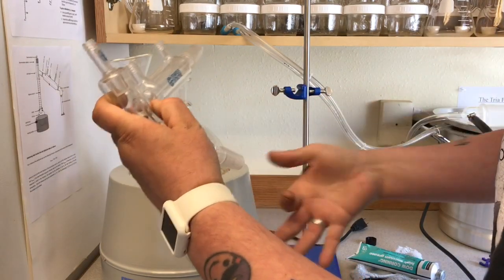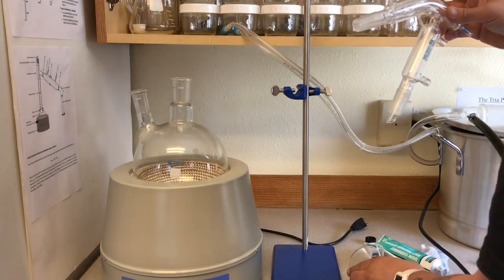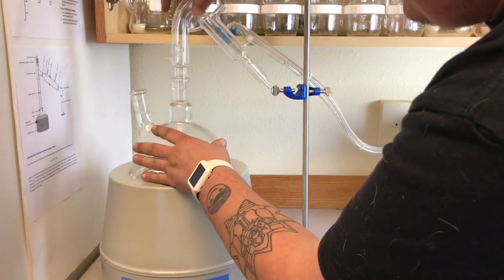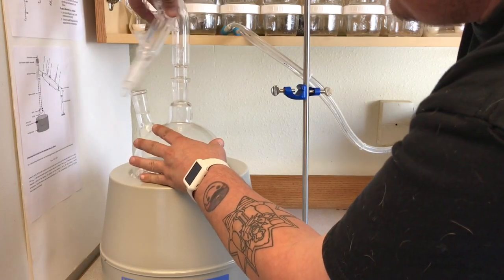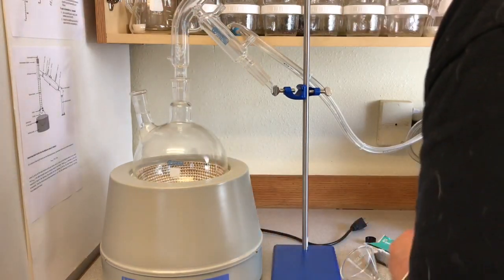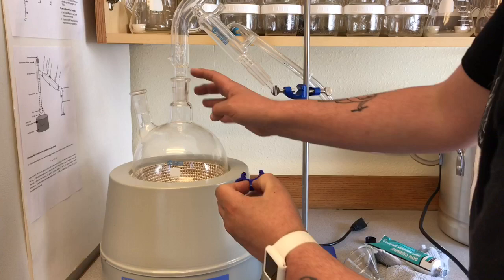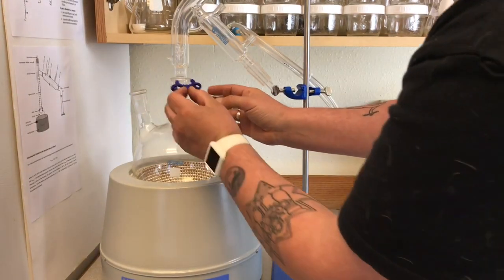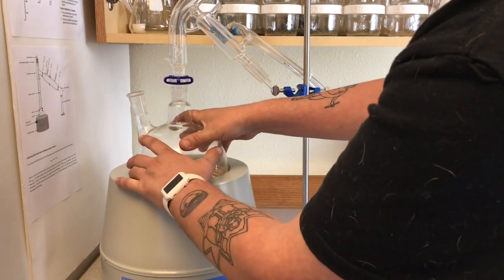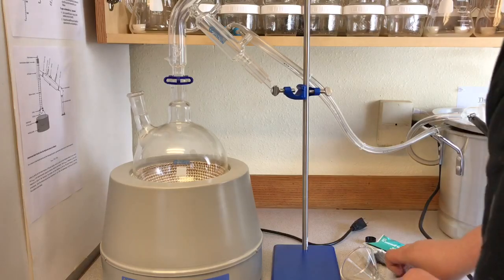And then as we place this joint in there, we'll turn it a couple of times and watch it make a seal. So we'll pull out my funnel here, and we'll take our distillation head, and this guy will sit in here just like this. And as you put a little pressure and you turn it a couple of times, you'll be able to see that seal right there. And now you've created that seal. And the next thing we'll do is clip that piece together. This is called a Keck clip, and these are 24/40 connections. This is a 24/40 Keck clip. So I'll take my Keck clip and I'll put him right here, and I want to make sure that I've got enough room for this guy over here, so when it comes time to add the material, I'm ready to go.